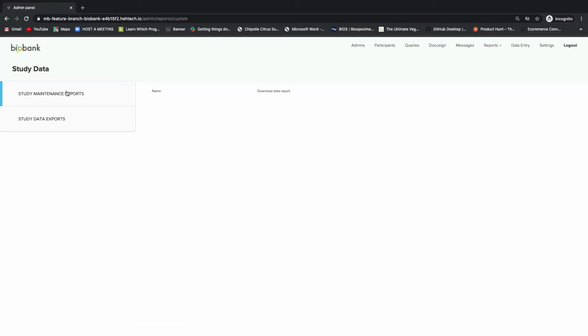And I just want to preface that by saying the reason for that discrepancy is because the Biobank website is currently in our preliminary stage environment where it's not connected to the Eureka platform, not connected to our data management systems. So that's why we're not seeing any of the reports here. However, when Biobank is pushed to the normal stage environment, you will begin to see the reports, and you can start playing around with them.